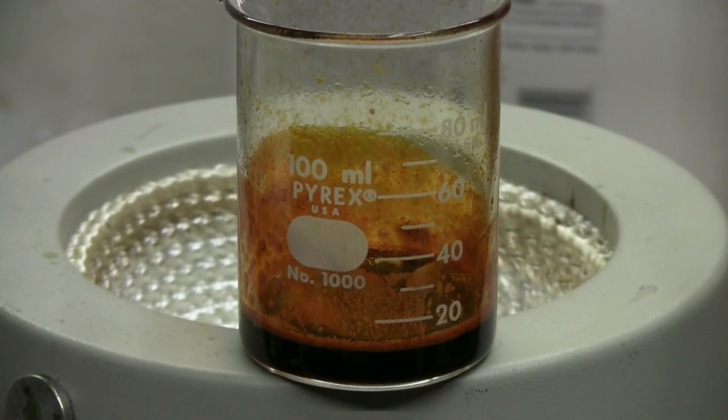Here's the result of my Soxhlet extraction of sweet paprika powder using ethanol. I've reduced the contents of the beaker from about 40 milliliters down to about 10. This is now ready for me to put in a storage bottle and use.